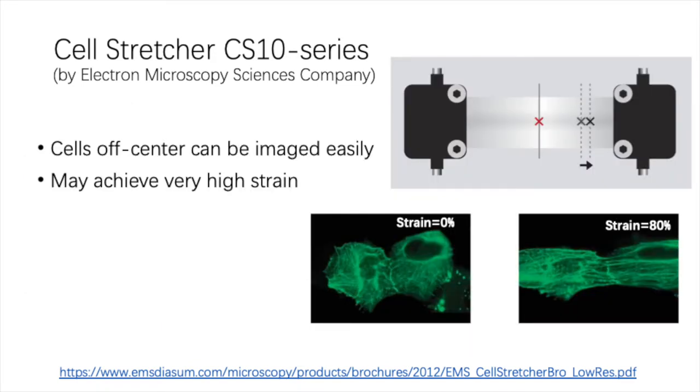An upgraded version of this device adjusts the x-axis with a compensation motor to keep the sample in the field of view when stretching. And since cells are seated on a thin membrane, high strain is achieved as shown.